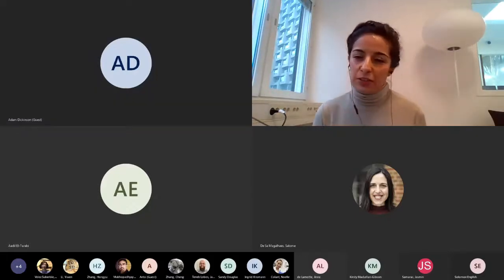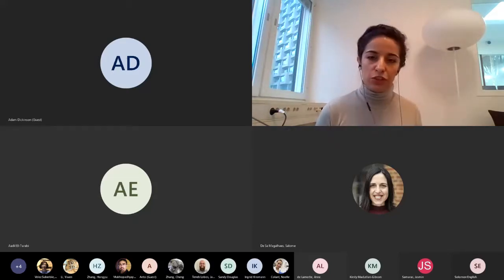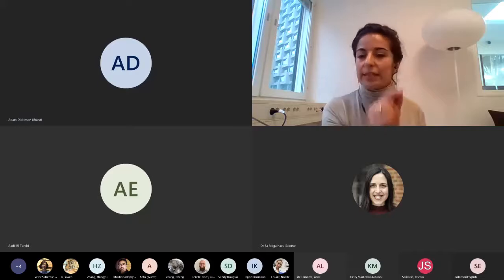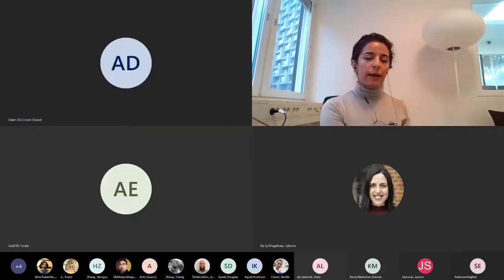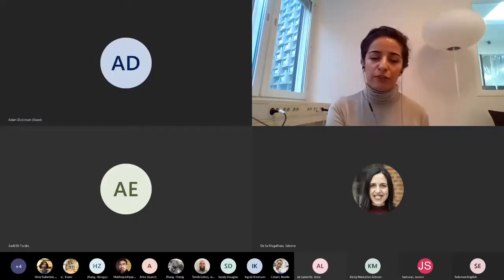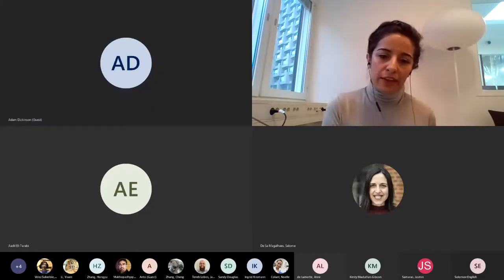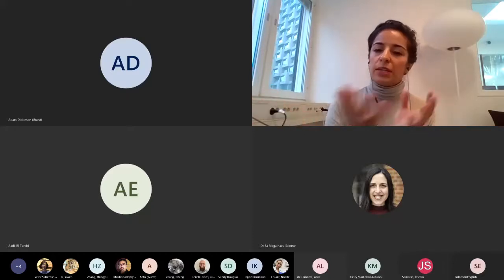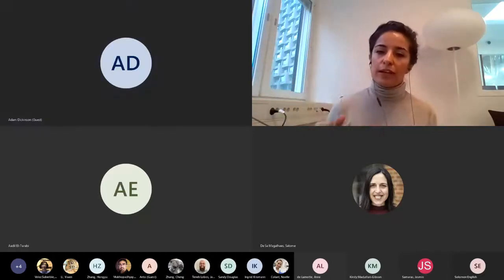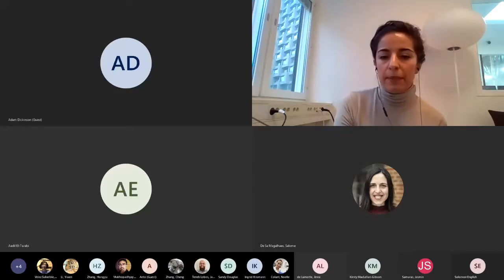You don't need to do the gold labeling each time, but it could be a good thing to do in the beginning. I know they do that often, for example, for exosomes, but it is quite a helpful tool to have. So it's about sitting together, looking at the particles, using other orthogonal methods, seeing what is in your sample from different angles, and then narrowing down with confidence what you're actually looking at, especially when it comes to VLPs.